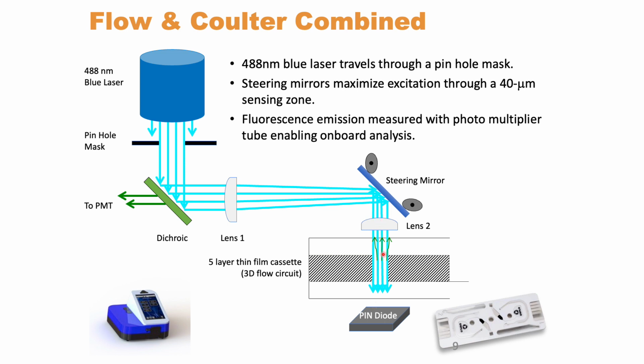So here's also where the cells will travel through. The cells can then emit color if they have been treated with fluorophores or propidium iodide, which we'll talk about in a second. And now note that you also have here an electric gradient, and you will be able to decipher the phenotype of the cell, the size, and the viability.